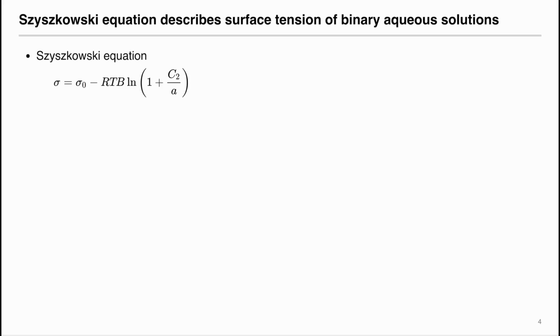After knowing how to calculate interfacial tension using the inverted drop weight method, we can explore the effect of the concentration of the solution on interfacial tension.